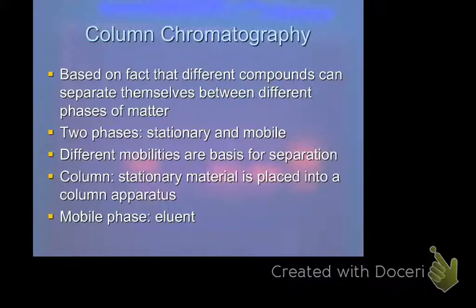And you can also do other types of what's called affinity chromatography, and I'll go through some specific examples of that in a moment. For example, the HIS tag or the GST tag and MYC tag and things like that. Those are the ones that are tags, and I'll explain what that means in a moment.